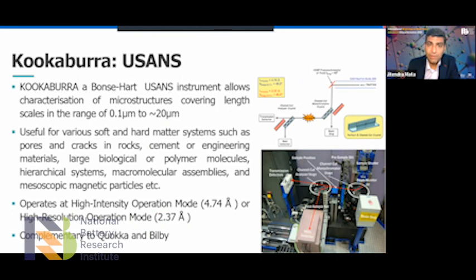To explain this instrument, I would say it is like a periscope. If you are shining a light from here, and I'm standing here, this becomes like a periscope and I can see the light if these two mirrors are perfectly aligned. We have a rocking curve on this mirror. We have a rocking curve on both crystals, but for normal operation, we only rock this crystal. When we rock it, we go from the negative angle to the zero angle and then the positive angle. Now this is the beauty of the USANS instrument. This rocking is so precise. We actually measure one thousandth of 1 degree at a time.